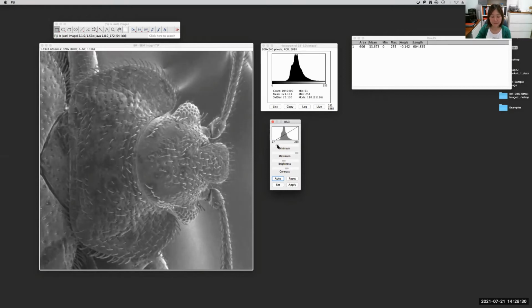And as long as the minimum pixel intensity is below 61, you can move around. Just by checking images, you can decide how much, from which pixel intensity, you want to cover.